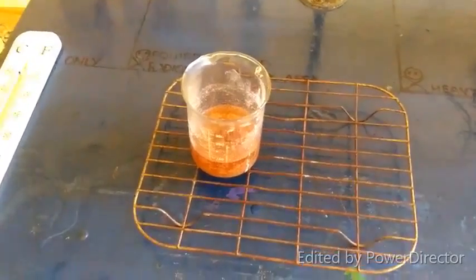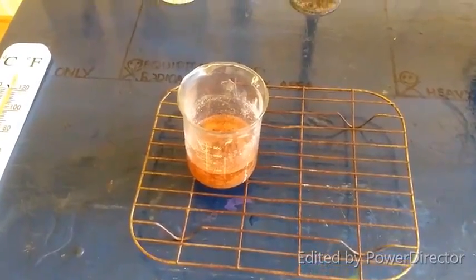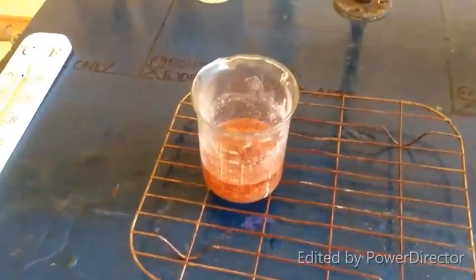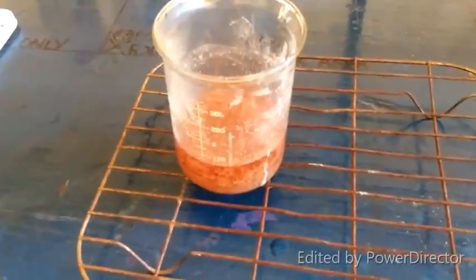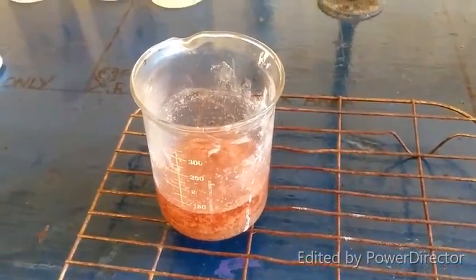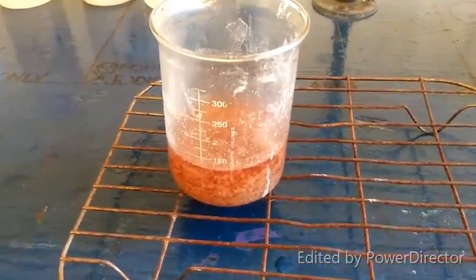Alright, everybody, so I dried the crude anthranilic acid overnight, and after doing that, I have dissolved it in 125 milliliters of boiling water. It almost completely dissolved except for a few little pieces, and then as soon as it started cooling down, the anthranilic acid started crystallizing out of the water.